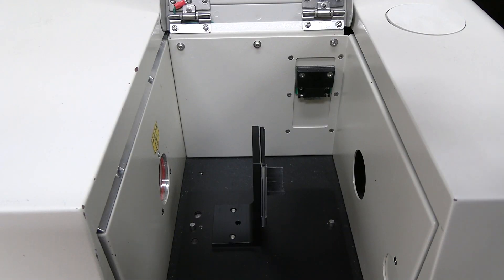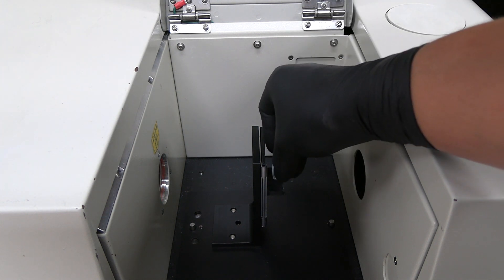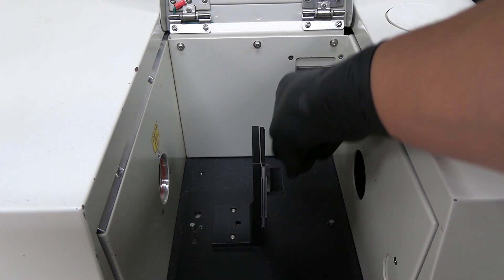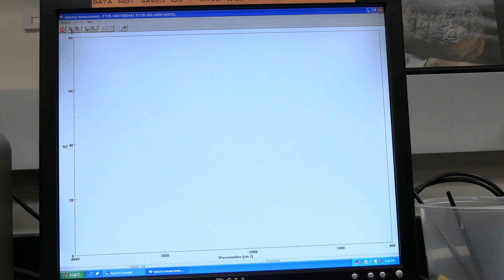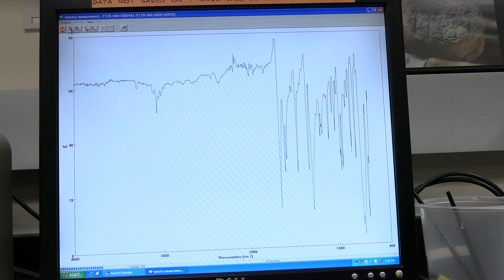If using the plate holder, place the salt plate on the sample holder. Ensure the sample side of the plate is facing towards the right of the sample chamber. Click on the sample button and wait for the measurement to finish.